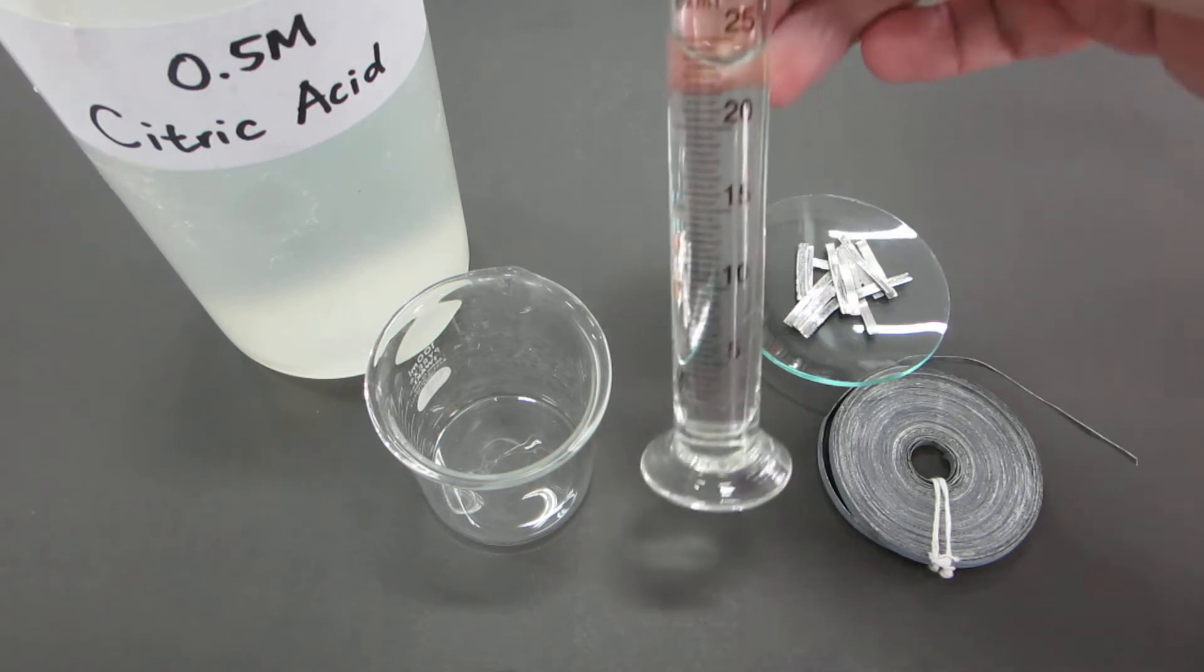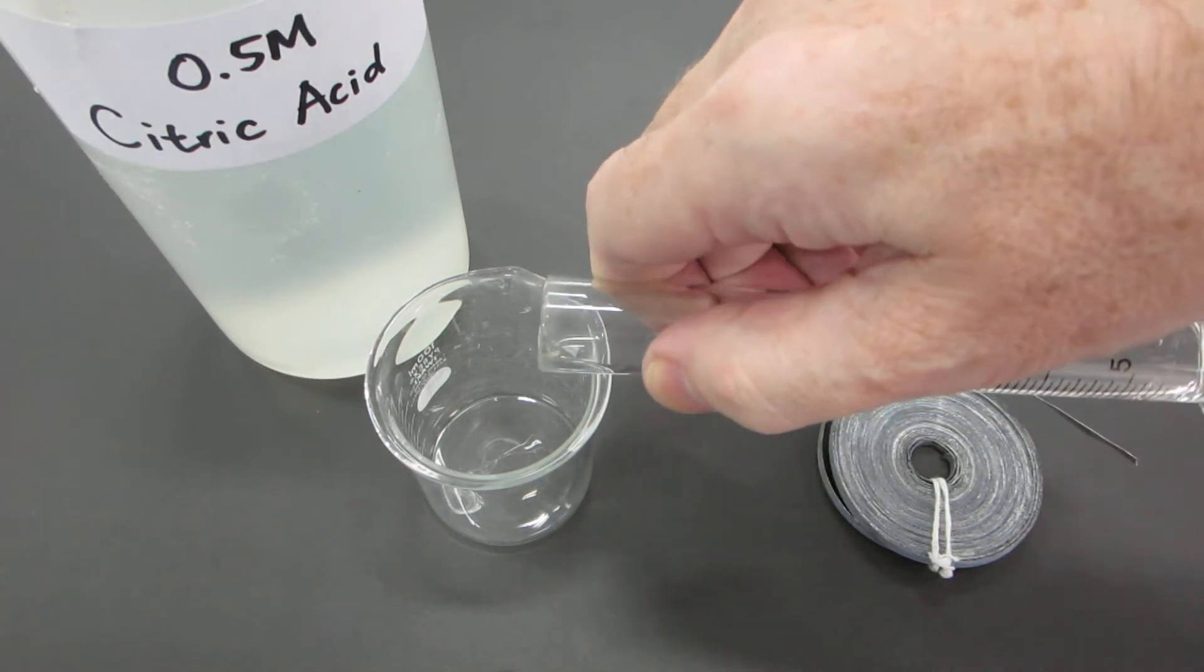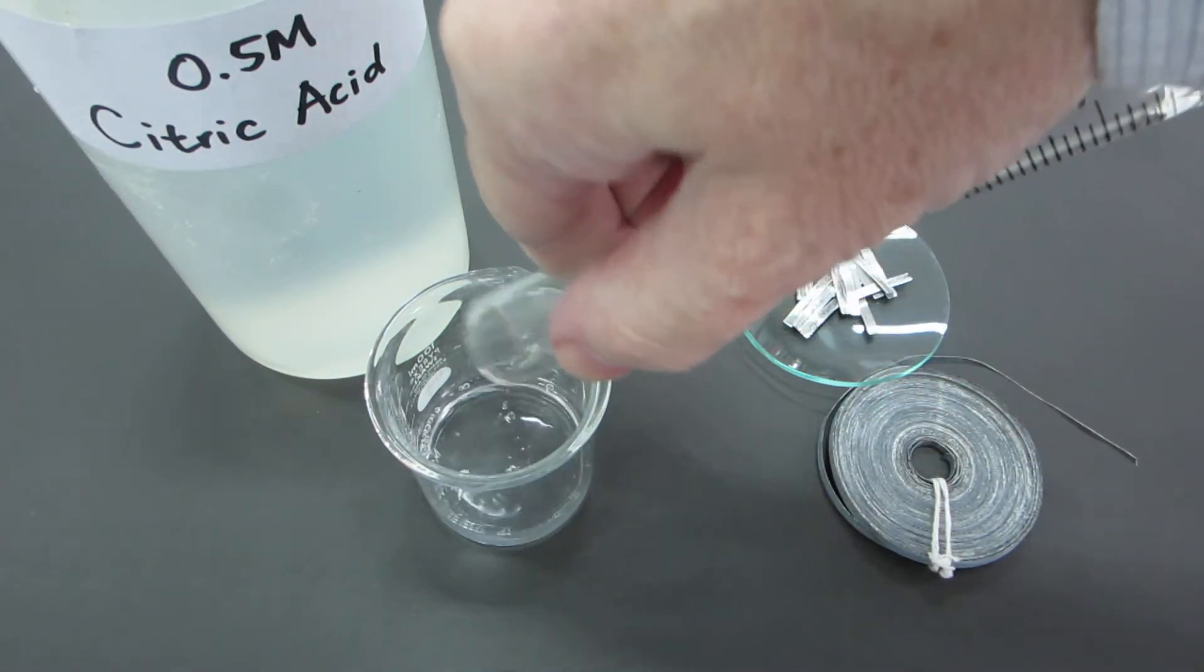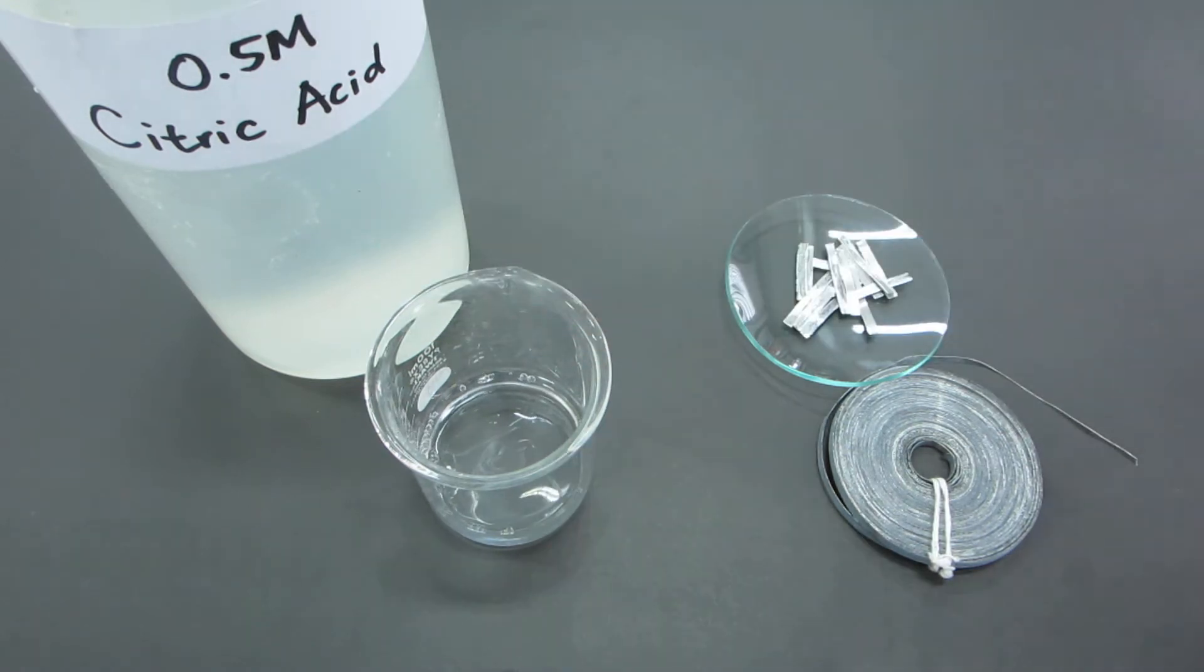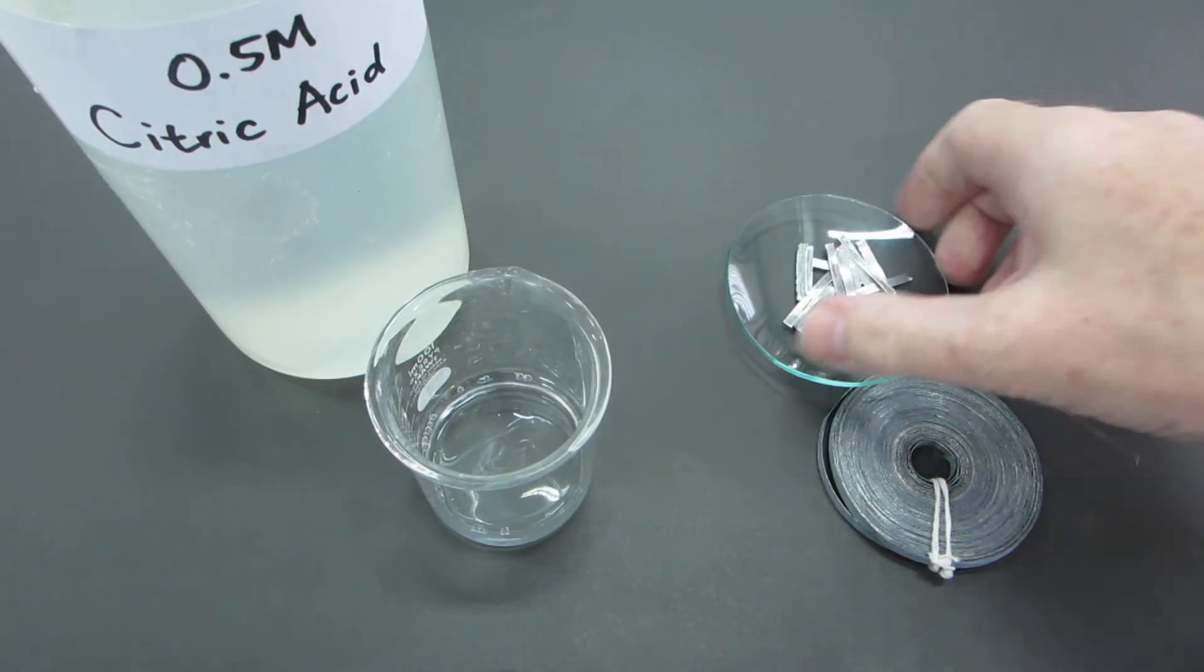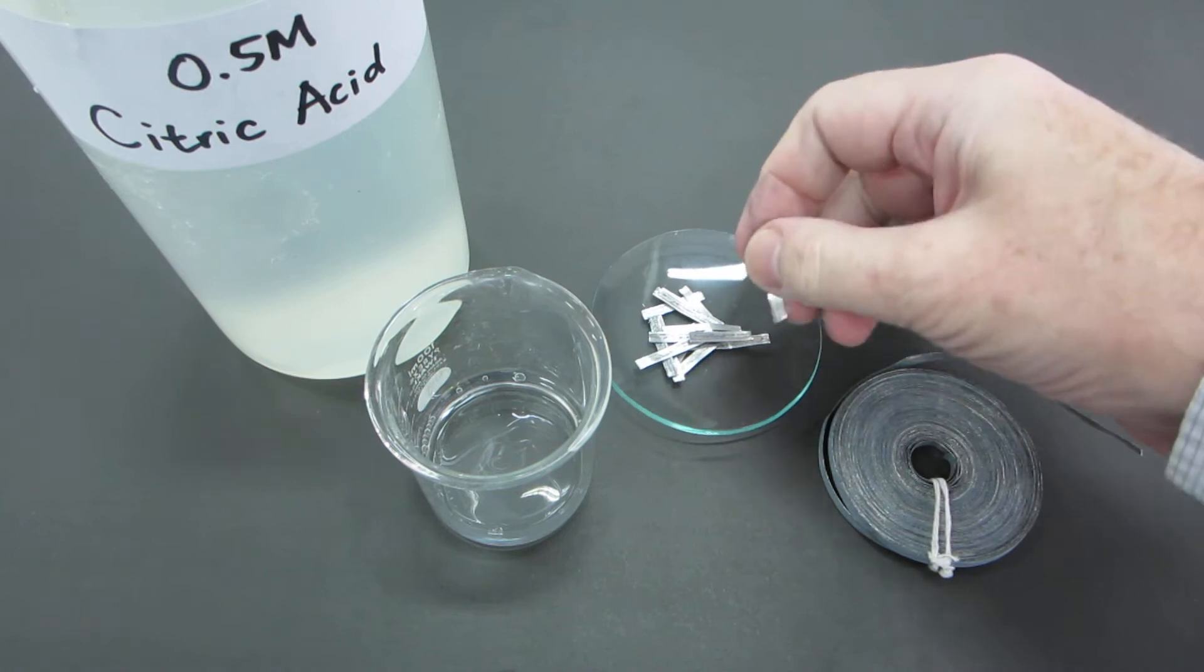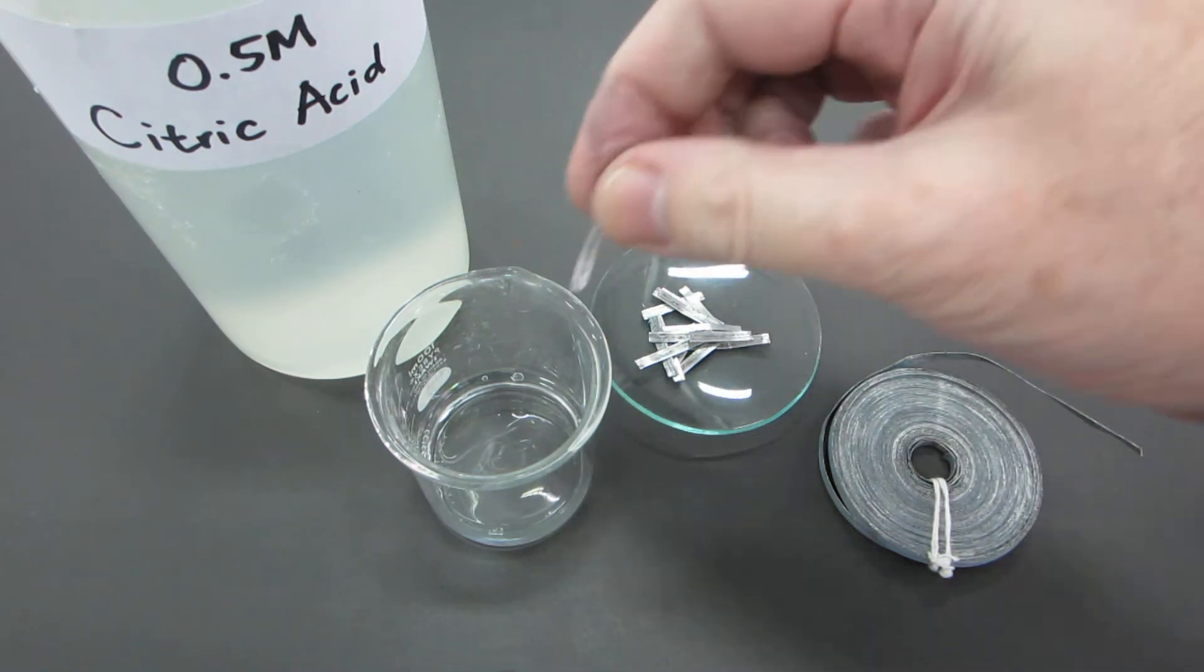Let's take 25 centimeters cubed of 0.5 molar citric acid and to it add some magnesium metal. Here in total on the watch glass we've got 0.54 grams.